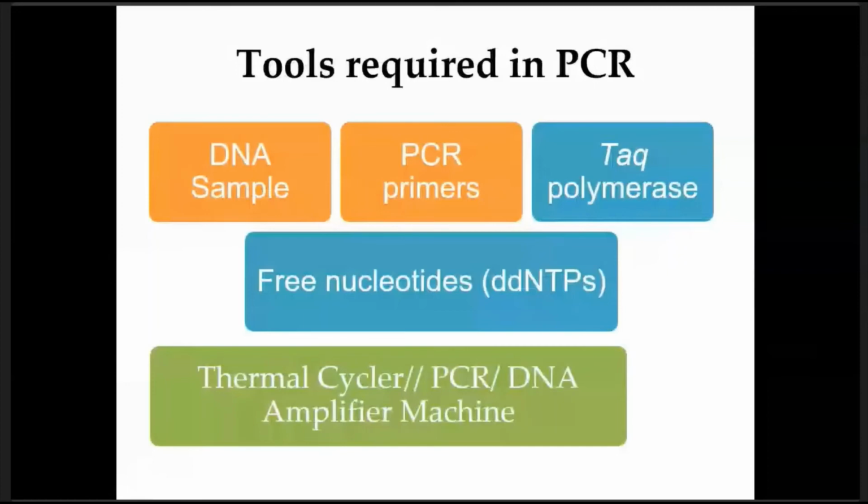In DNA replication, the primer was produced by the enzyme RNA primase, right? That is in your cell, but this one is using a machine. So you just mix into the reaction the prepared primers, the primers that are already available. We call it PCR primer, and then Taq polymerase. Taq polymerase functions like DNA polymerase III in DNA replication.